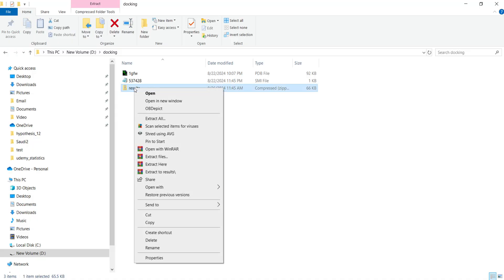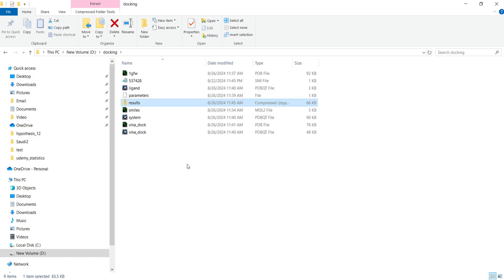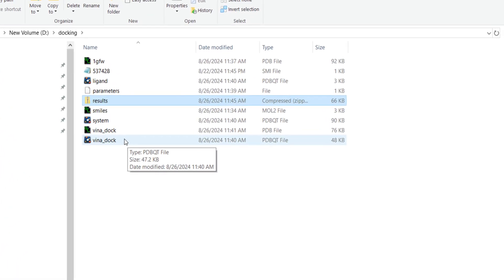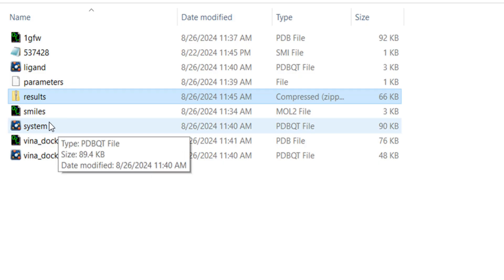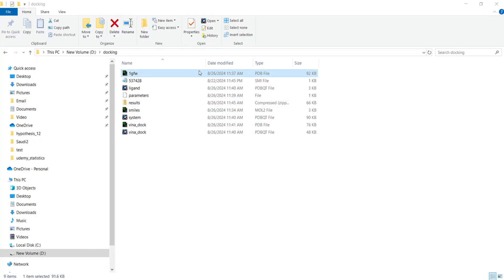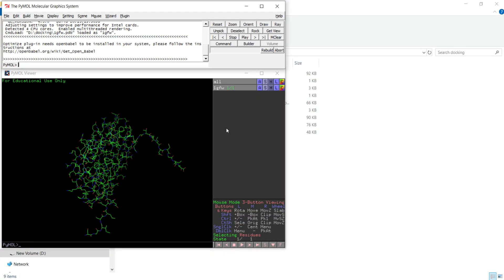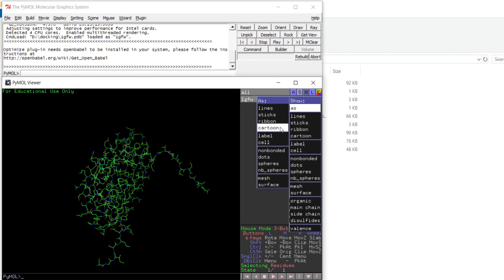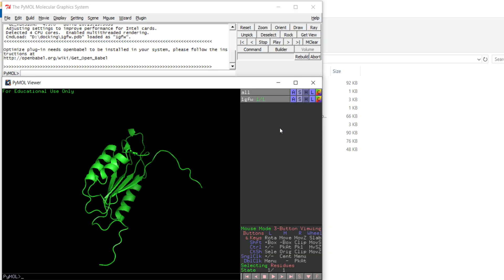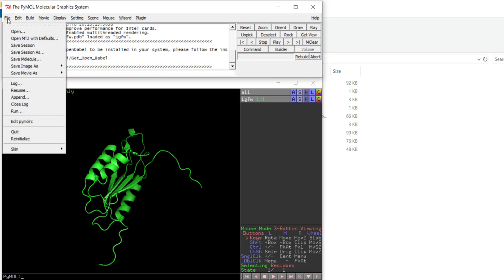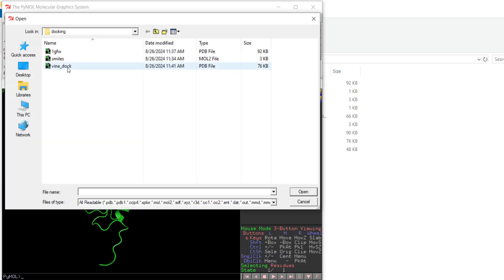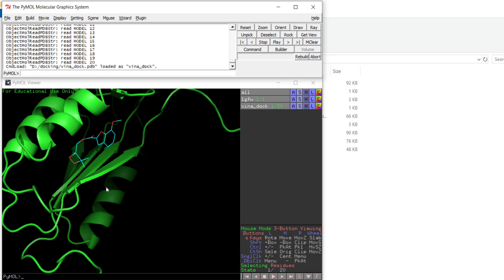Once the contents are extracted, you will see multiple different files. Now let's open the PDB file in PyMOL. This is the 3D structure of the protein we uploaded. Click 'S' to change its representation to cartoon. To load the ligand poses, click File > Open and select the 'vina_dock' file extracted from the ZIP folder. Once you do that, all 20 ligand poses will be loaded in your PyMOL window.